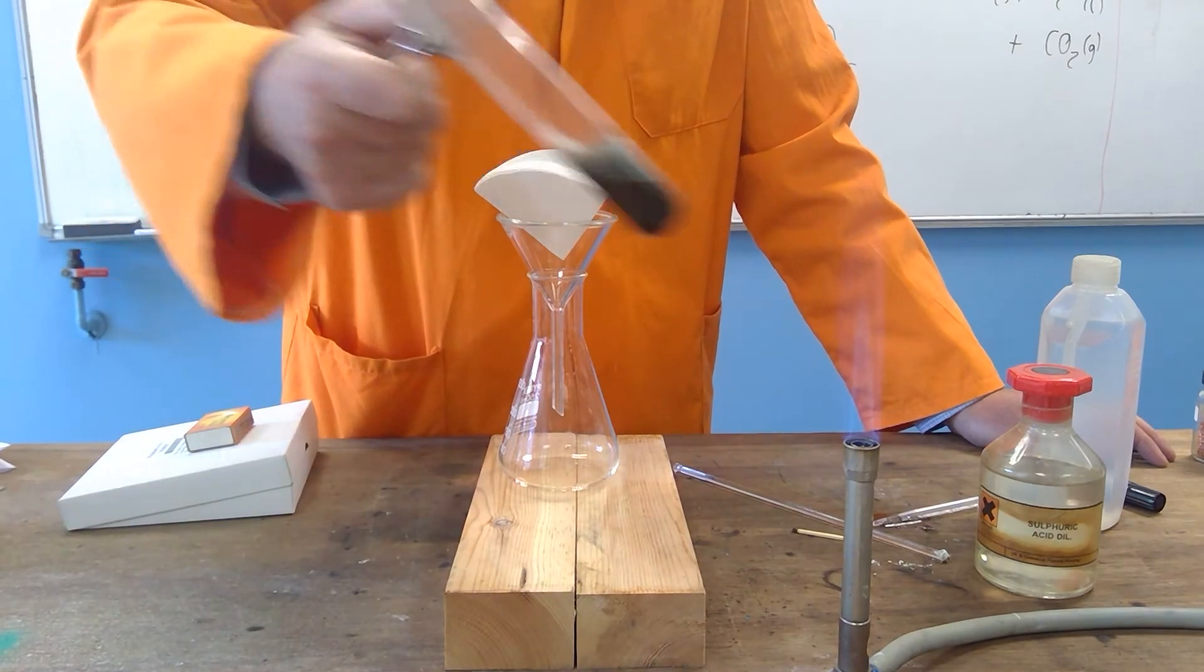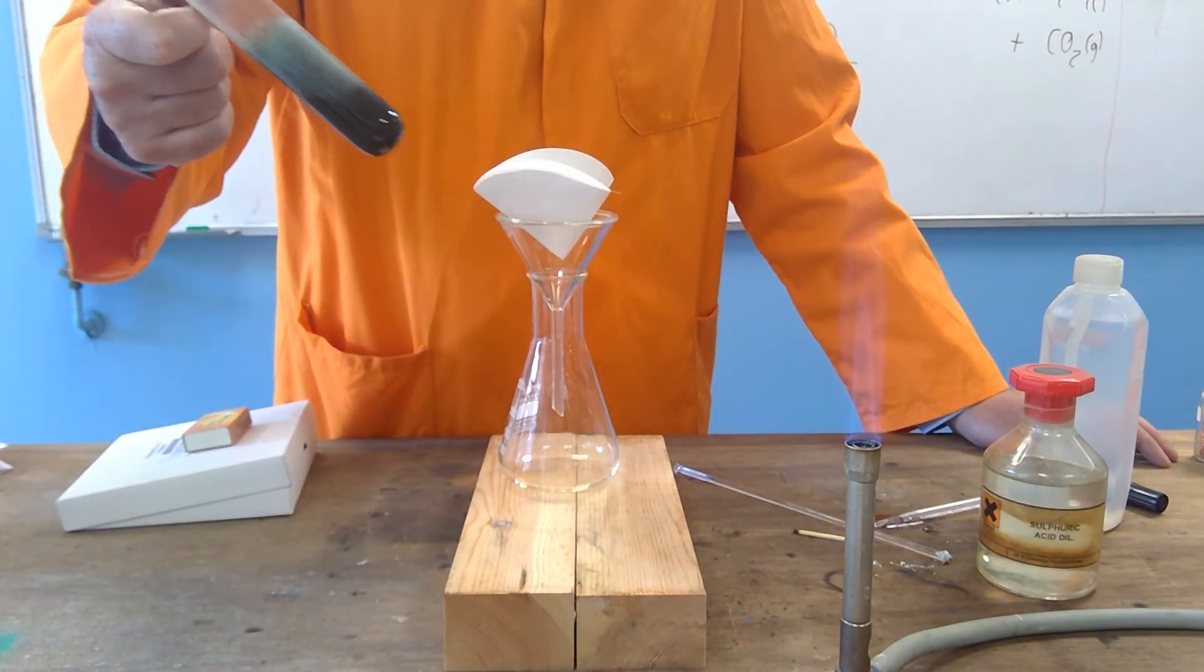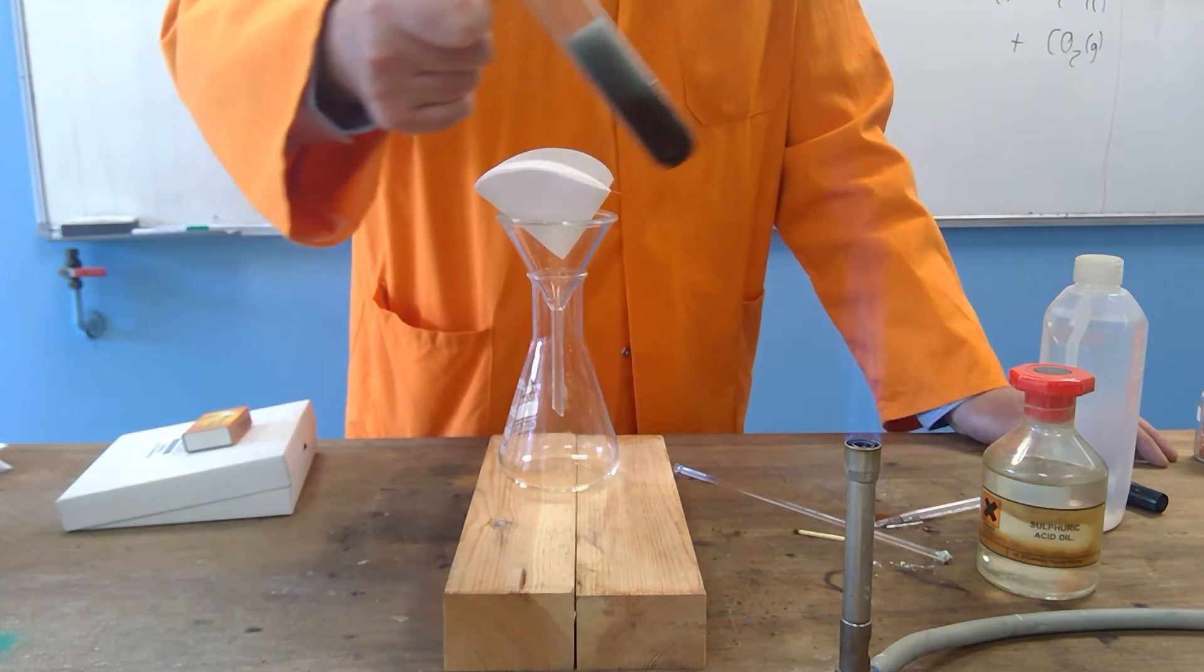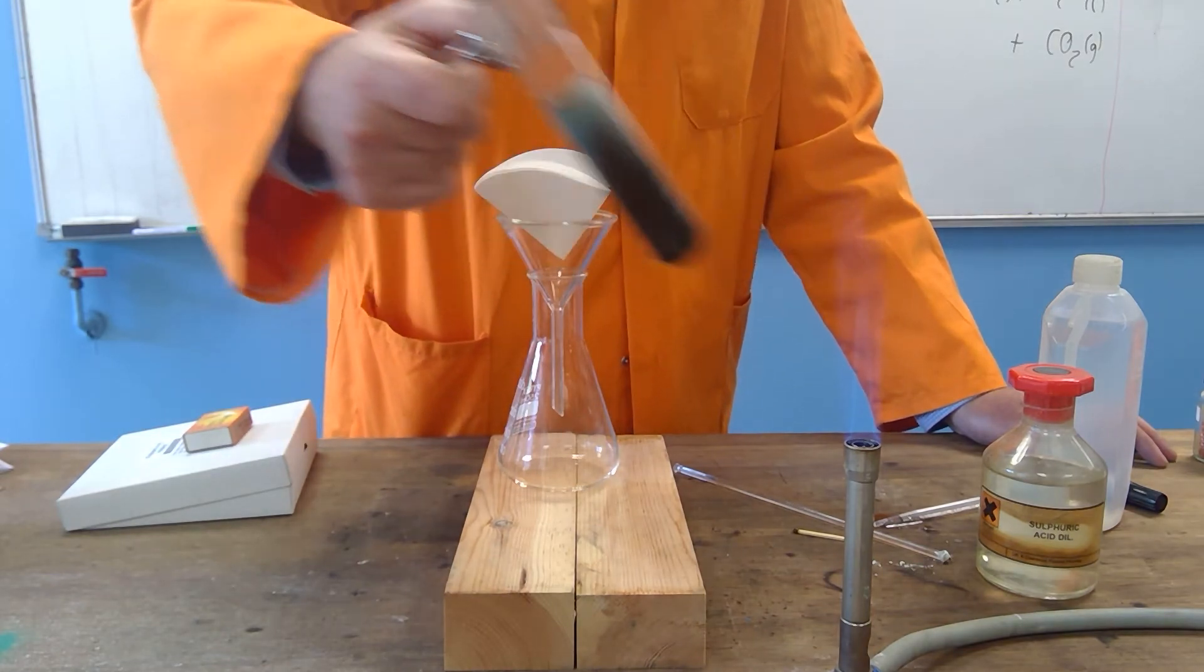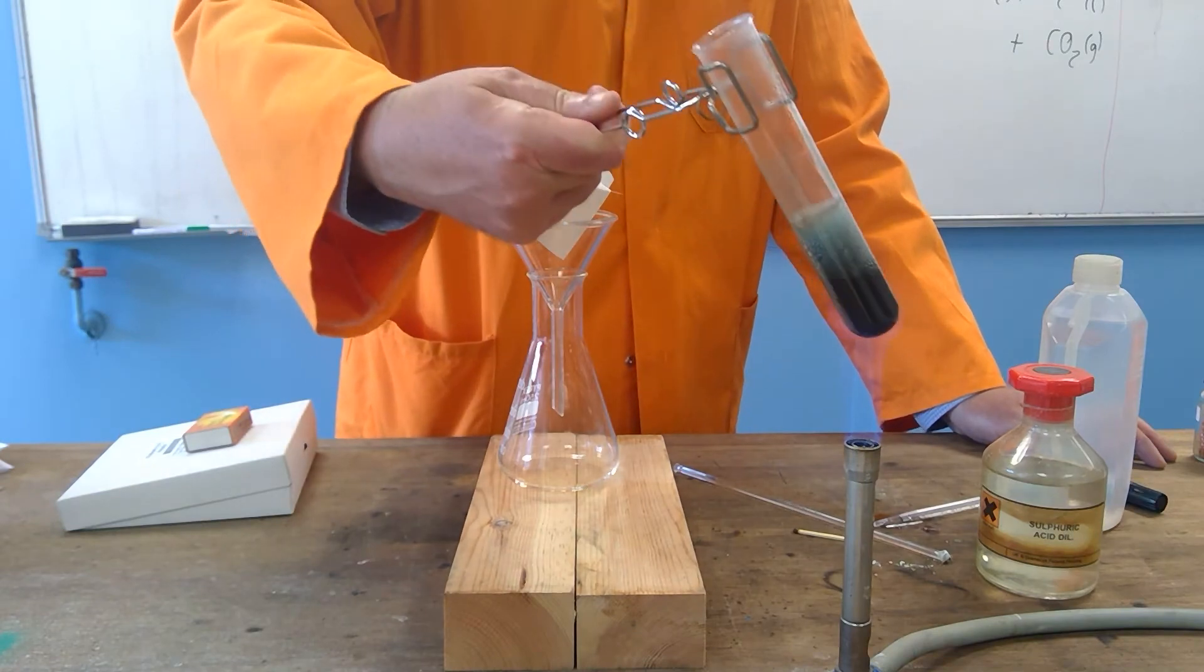This produces copper sulfate and water. So a metal oxide like copper oxide, plus an acid like sulfuric acid will make a salt. Notice how I take it out of the flame when it fizzes up, so you can actually feel the vibrations through the end of the tongs.